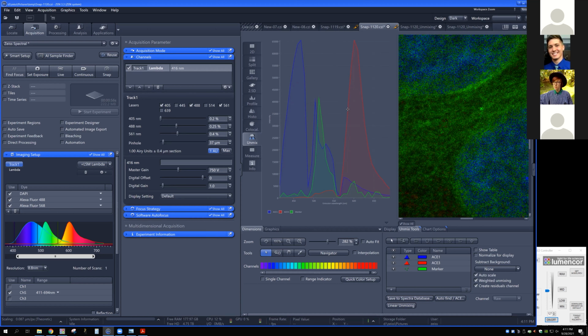So if you balance things right, both between spatial separation and spectrally separating fluorophores or targets that you think are going to co-localize. If they are going to co-localize, you probably want them to be spectrally as far apart as you possibly can, so that you have confidence that you are really getting co-localization in those cases. And then finally, in terms of working with the excitations, to make sure that you can get a good balance of signal across all of your fluors and across the entire spectrum.